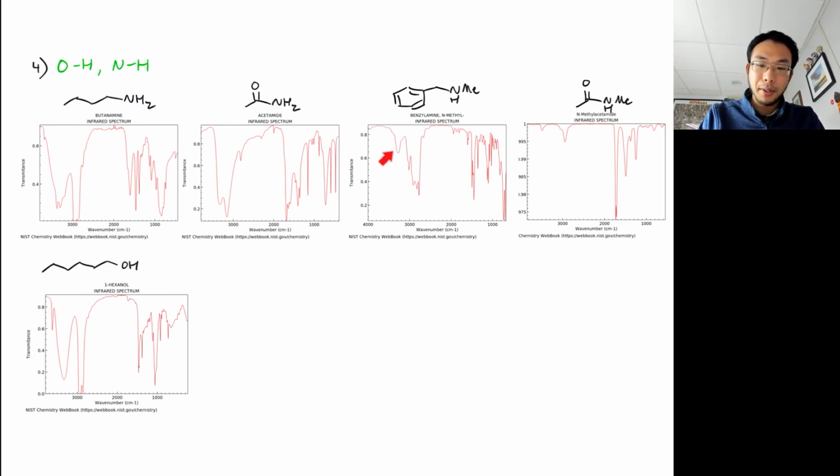So for example, if you look up here, this seems to be a narrower looking peak than the alcohol one here. So if you're observing this astutely, you might notice, well, why is there this single little peak way out here close to 4,000? Is that meaningful or not? And it turns out it is.